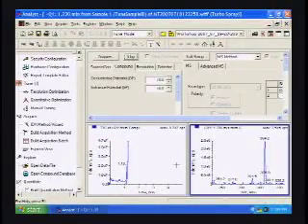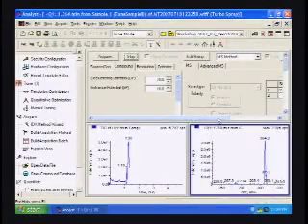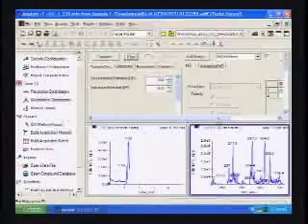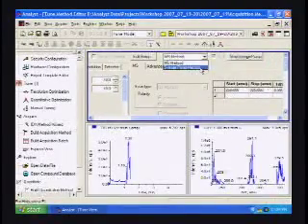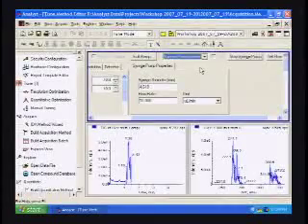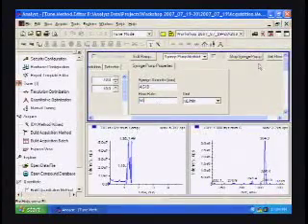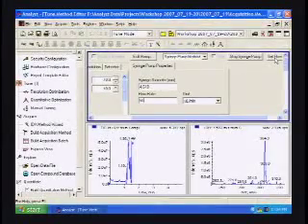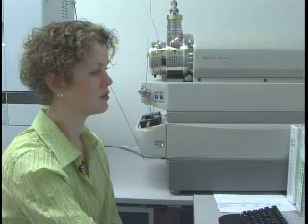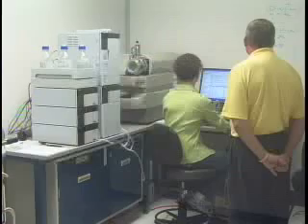Okay. What we probably should do is ramp the syringe speed up just to make sure that we're getting a good solution that we put in there through there. Yeah, you're probably right, Bill. Okay. You change that. We'll set it a little higher just to get some solution going. Let's see how that works. See, now we have a nice, big 304.